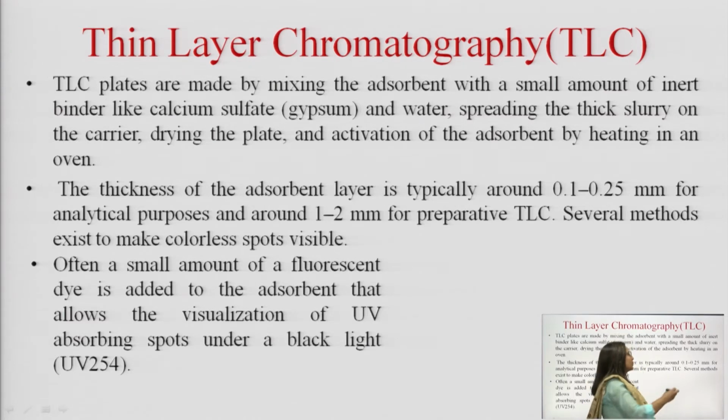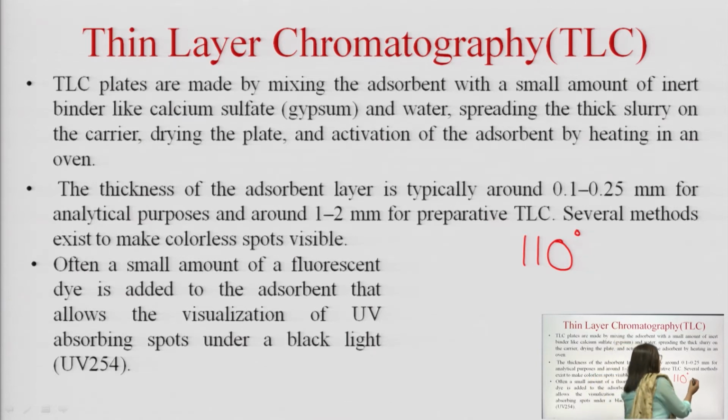So, activation is done at a temperature of around 110 degrees centigrade for 30 minutes to 1 hour depending upon the conditions. In BP it mentions 120 degrees centigrade.